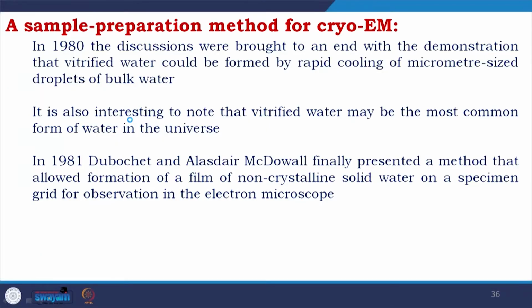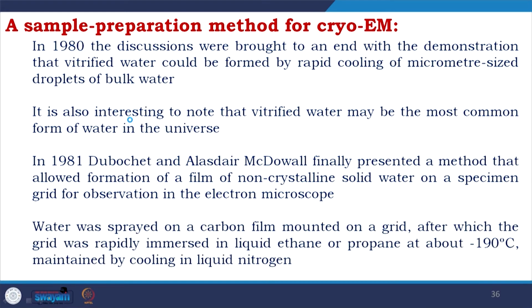In 1981, Dubochet and McDowall finally presented a method that allowed formation of a film of non-crystalline solid water on a specimen grid for observation in the electron microscope.